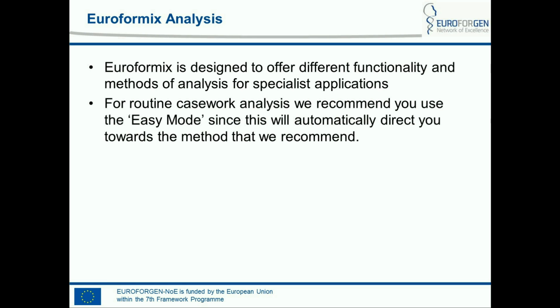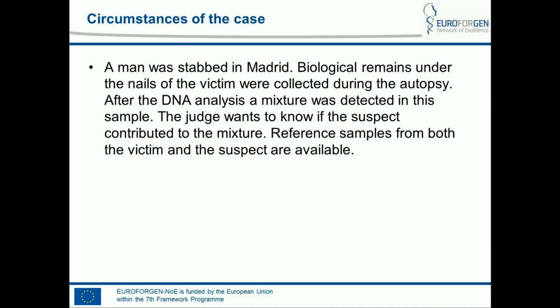So for routine casework analysis, we recommend that you use the easy mode, since this will automatically direct you towards the method that we recommend, and I'll demonstrate that in a moment.